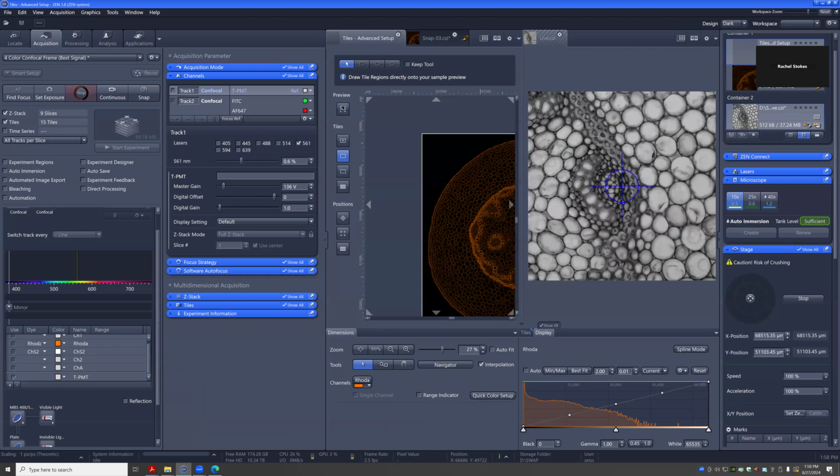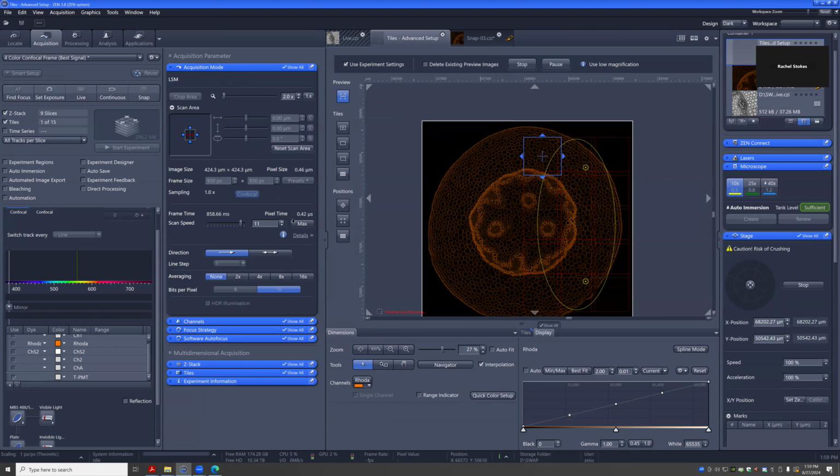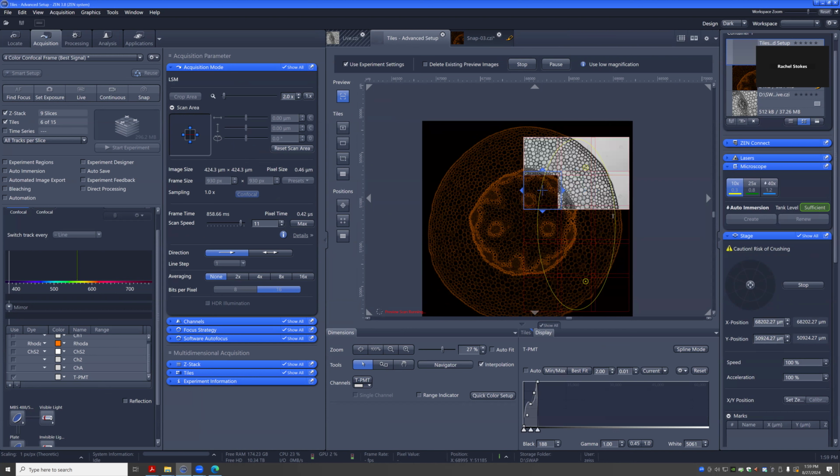So remember, I made the map through that preview scan right here. You could use the same experiment. Let's see, right here, don't delete the original. And then if I start right here, let's see if I'm relatively fast. So now you see a transmitted light channel map. If you want the map in transmitted light, this is what you would do.